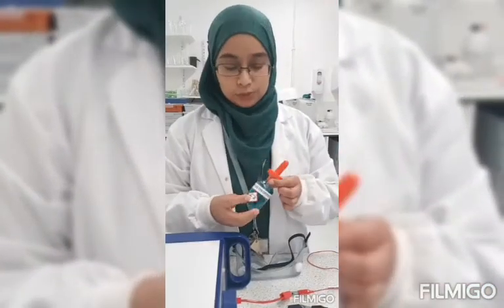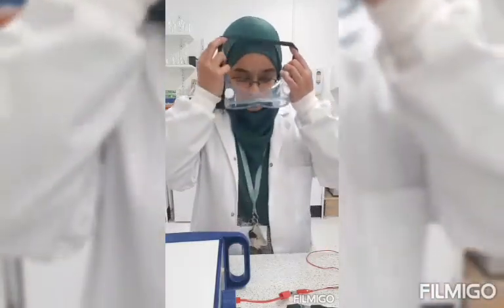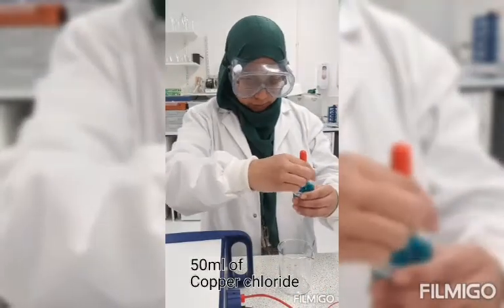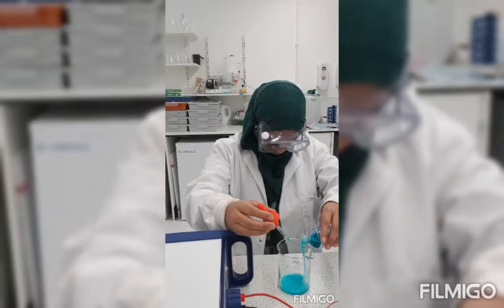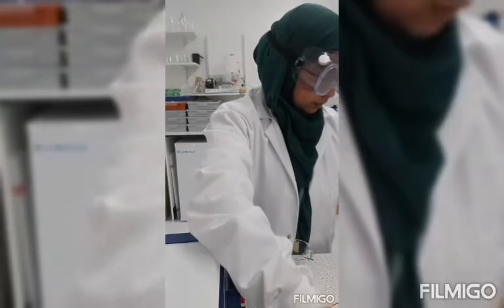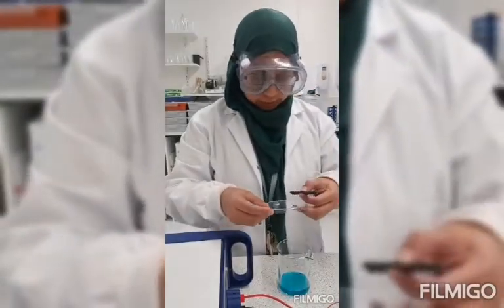For this practical, I'm going to demonstrate electrolysis using copper chloride. First thing I'll do is put my goggles on. Now I'm going to measure out 50 milliliters of copper chloride into my beaker. Then through my petri dish, which has holes in it, I'm going to put my electrodes in.